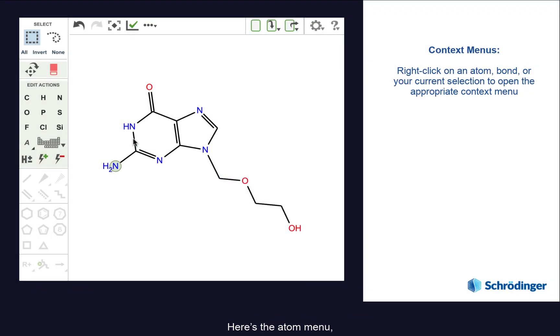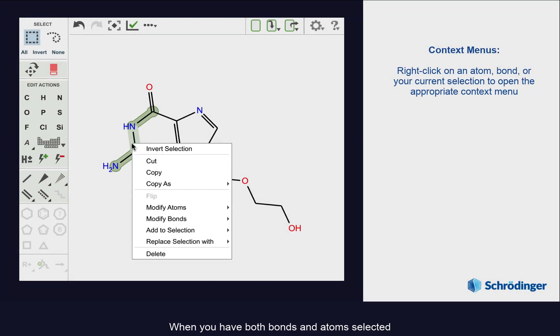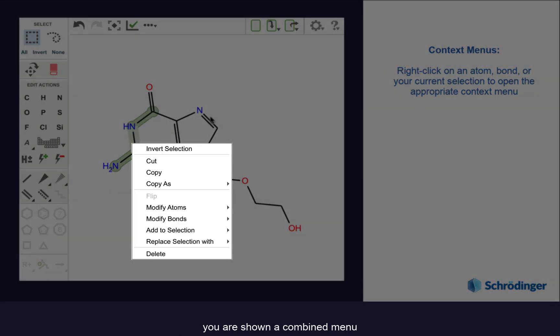Here is the atom menu, and here is the bond menu. When you have both bonds and atoms selected, you are shown a combined menu.